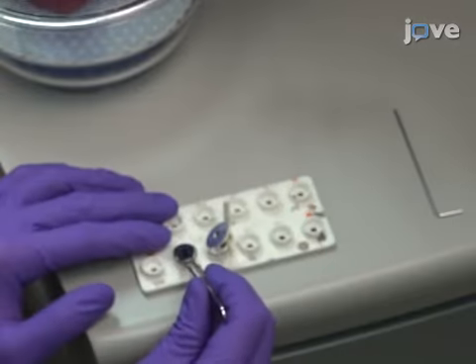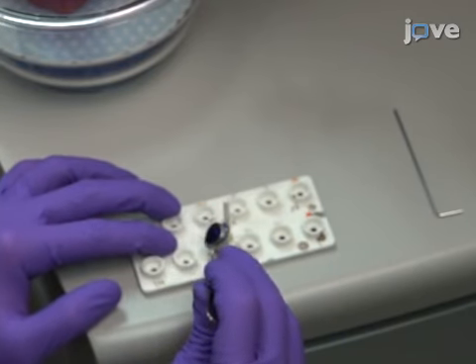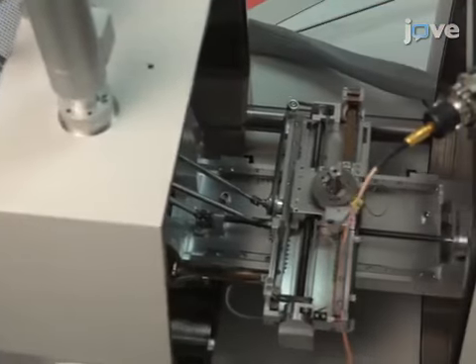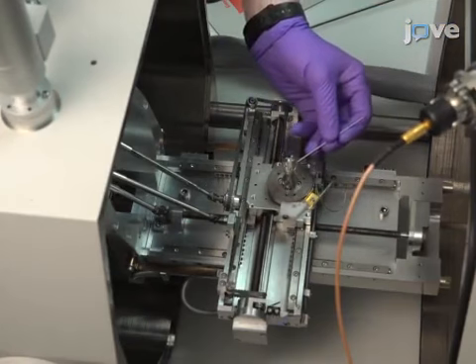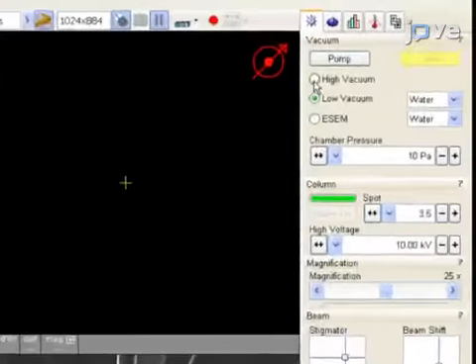For samples where the CNT cross-section will be milled, mount the stub in a 45-degree stub holder. Then vent the E-SEM, open the SEM chamber, and secure the stub to the sample stage. Close the chamber and start evacuation of the E-SEM.